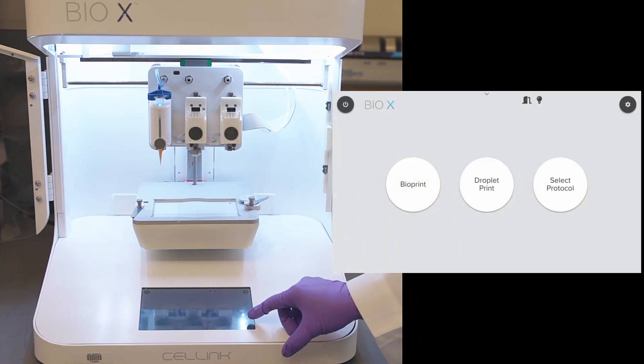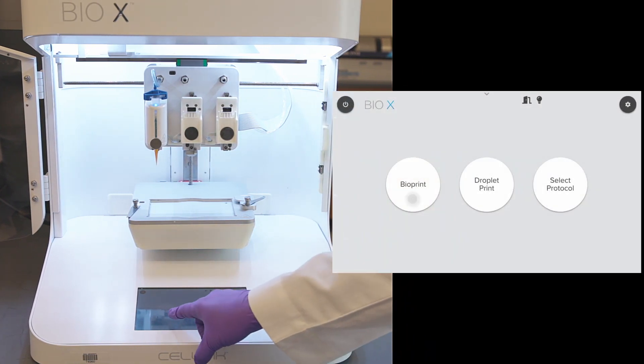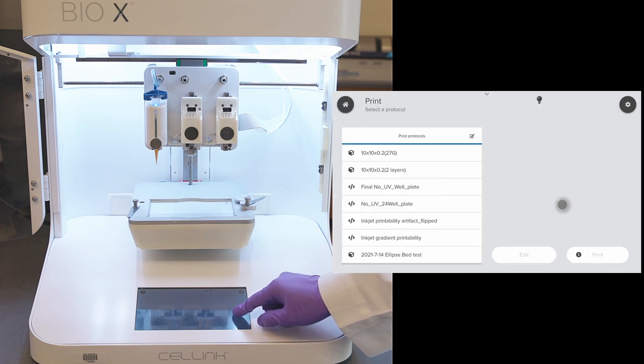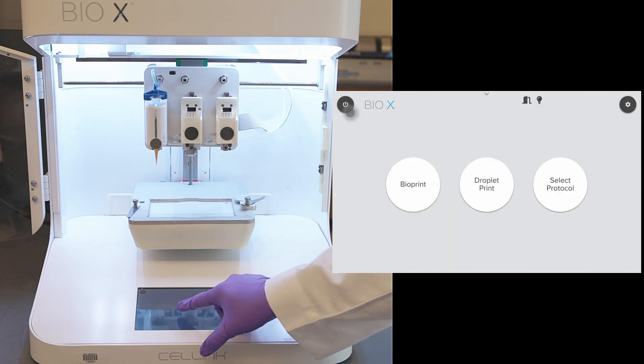On the welcome screen, we have three options for 3D printing: to bioprint, to droplet print, or to select a protocol. If we have already created a protocol, we can start printing right away. Today, we will be using the bioprint option.